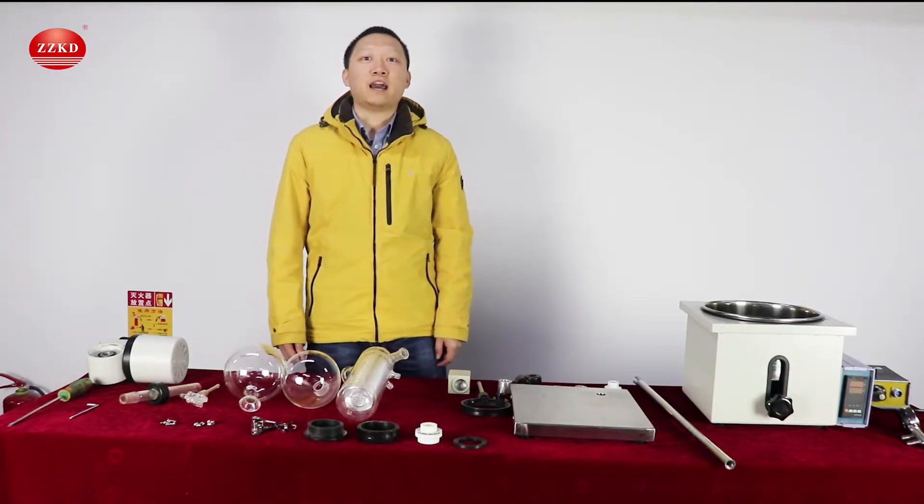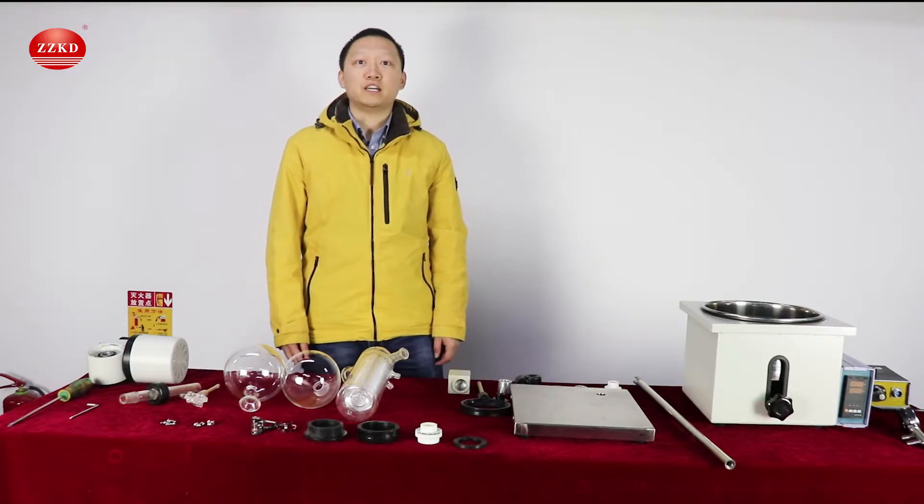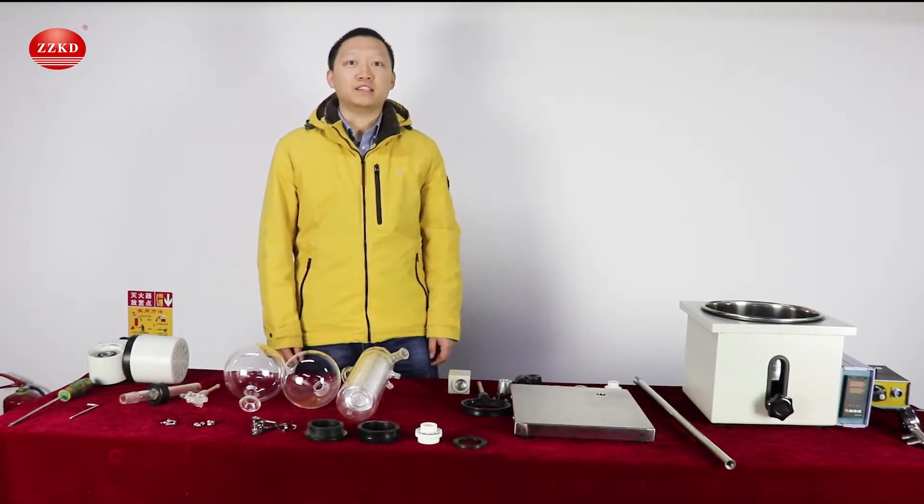Hi everyone, it's George here. Today I will show you how to assemble rotary evaporator RE-201D.